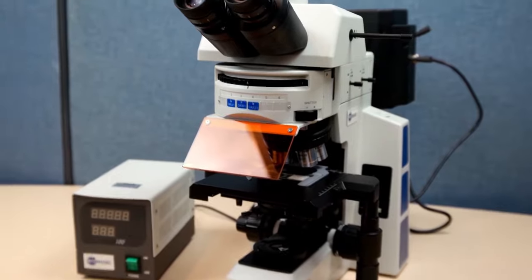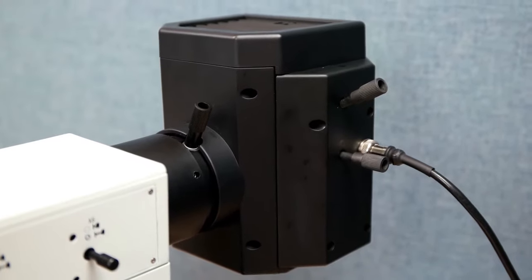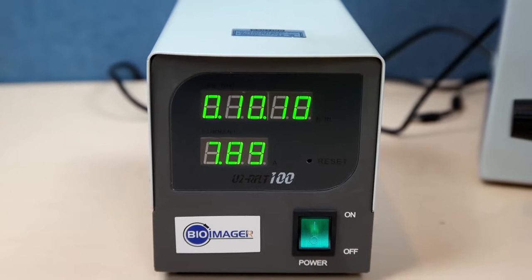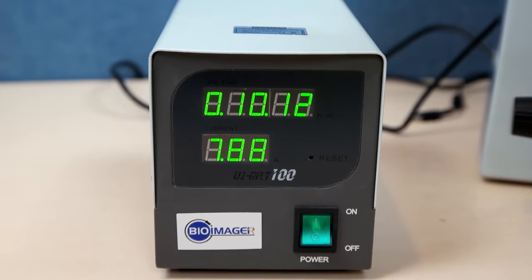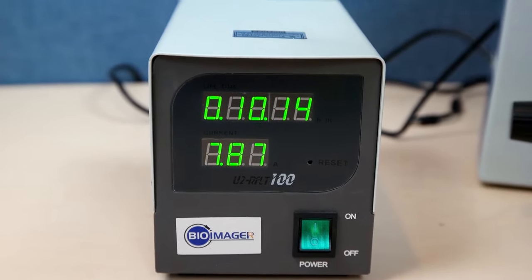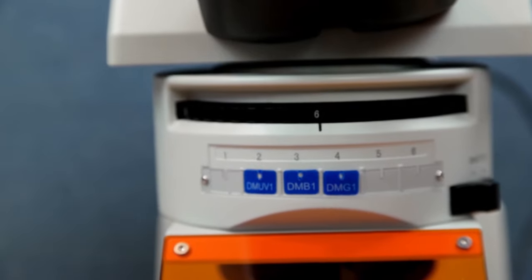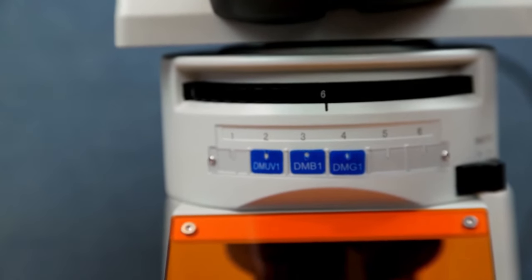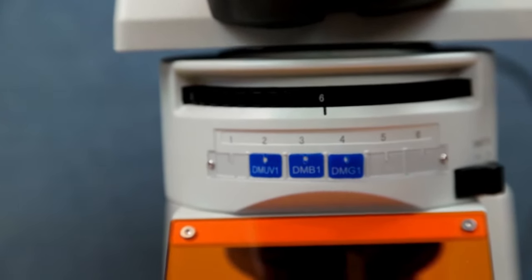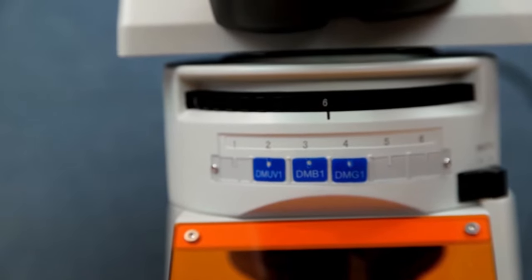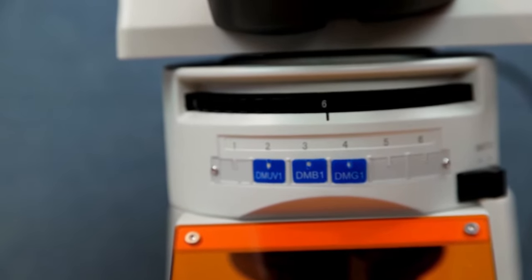For fluorescence imaging, this microscope uses a 100 watt mercury lamp package and includes a light source with timer at the front. It has a 6-spot filter wheel which includes three filters of UV, blue, and green excitation, or blue, green, and red emission.